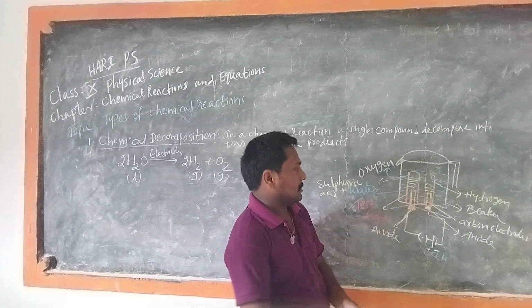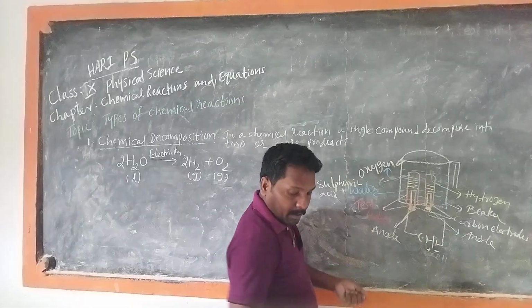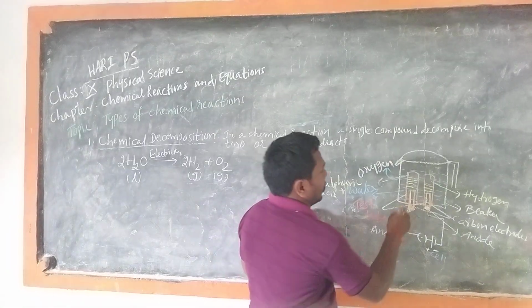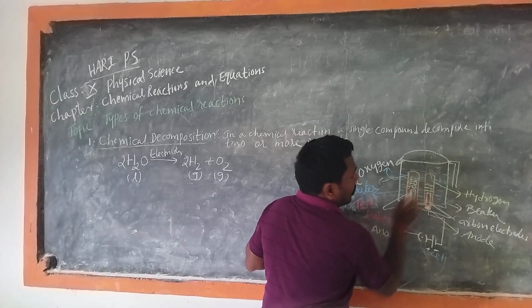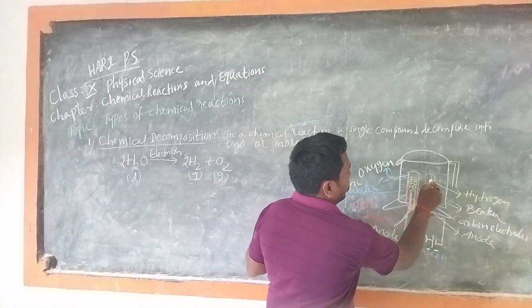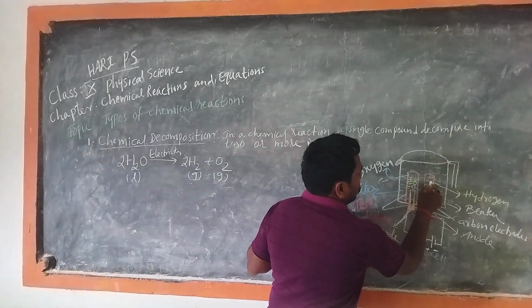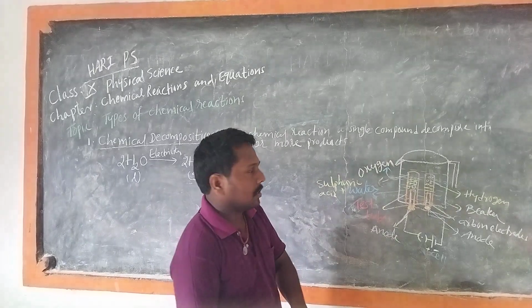So we observed that some gas bubbles are formed near the electrodes.